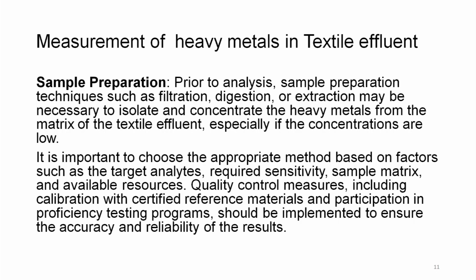Now, let me tell you that the textile effluent matrix is very complex, and all these inorganic, organic pollutants are all present together. So, sometimes it becomes mandatory to filter the sample or digest the sample or extract the sample, and therefore, sample preparation becomes mandatory.